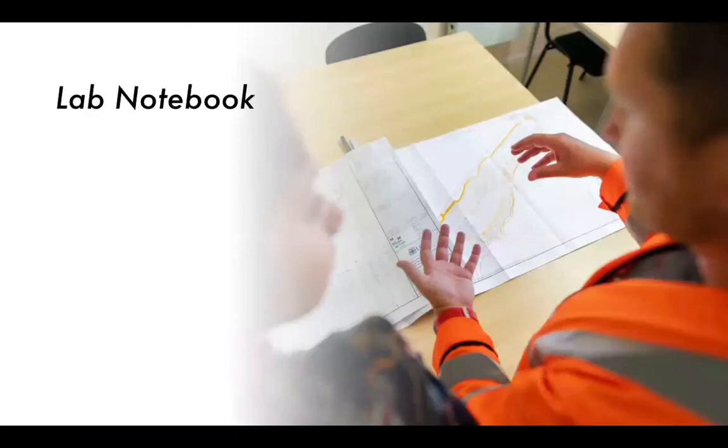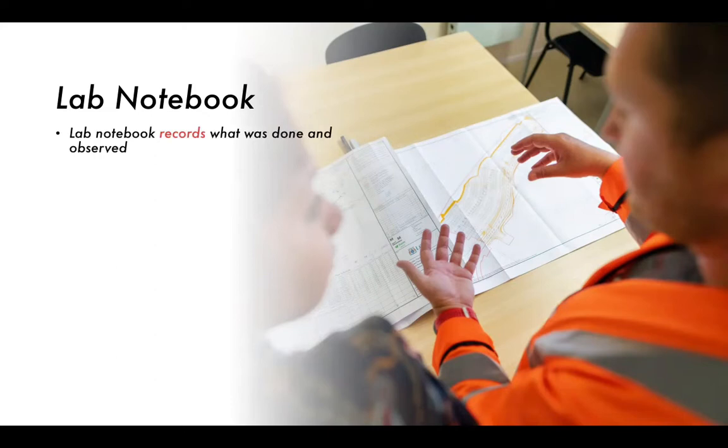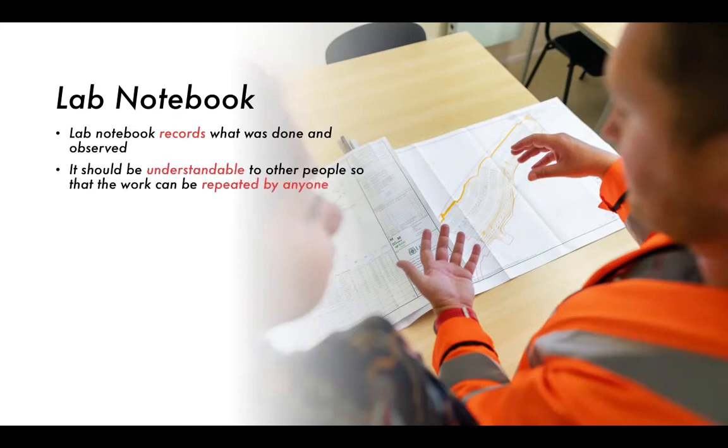So we'll talk a little bit now about some of the common equipment that we find in a lab. The first one is going to be the lab notebook. This is going to be a record of all the things that the scientist or the analytical chemist has done and observed. It is important that it's recorded in detail, any observations, any results. It should also be written in a way that is understandable to other people so that the work can be repeated by anyone. Often a considerable amount of your day will be spent actually writing in your lab notebook.